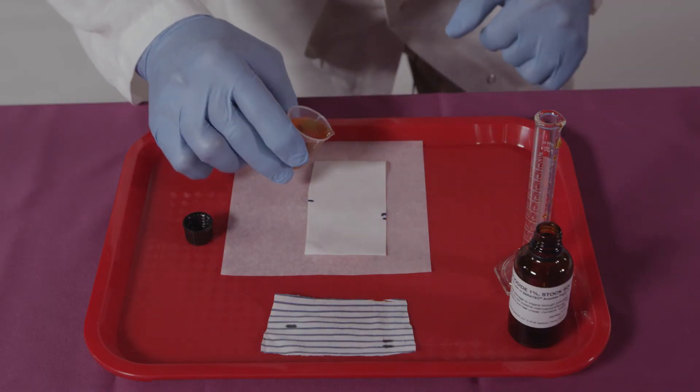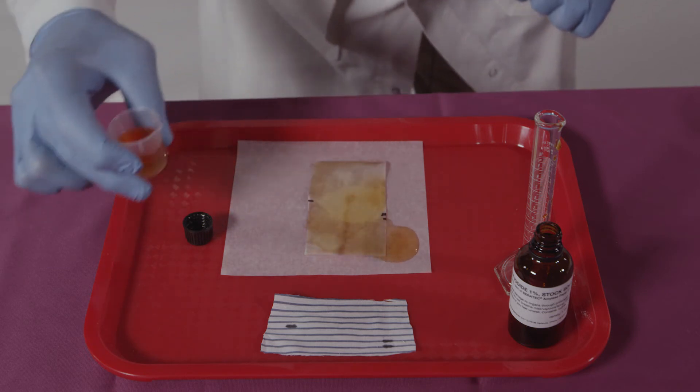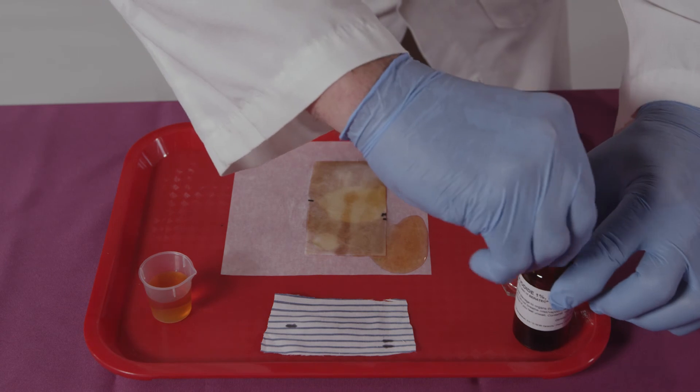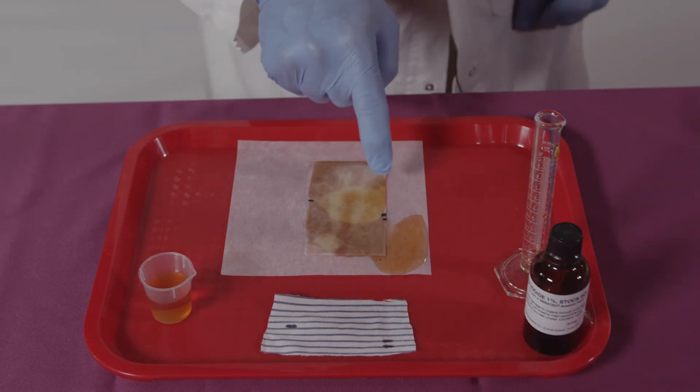After 10 minutes the working solution of iodine is poured over the paper covering the entire piece of paper in a quick motion. The solution may be applied with the optional spray bottle that is supplied.